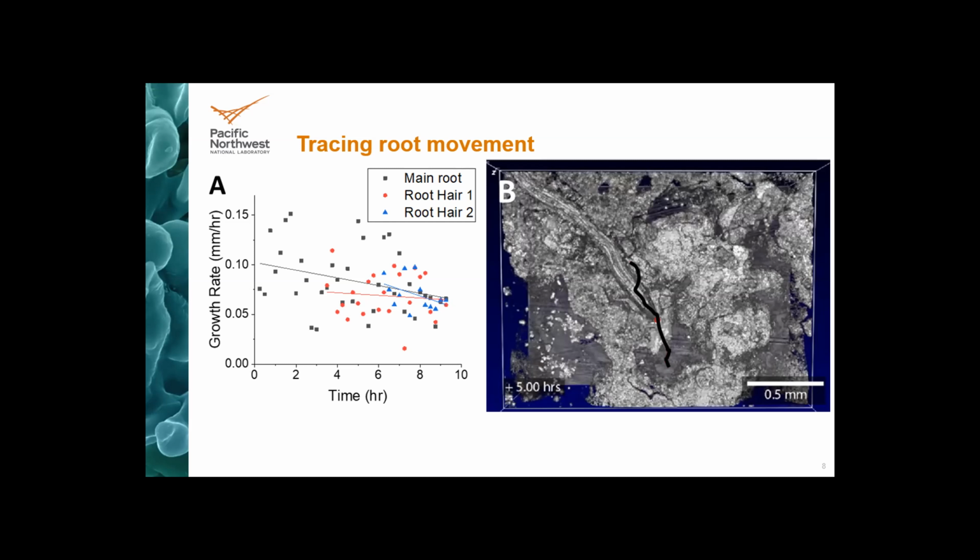Great. Thank you. And it doesn't have to be a 3D image like this. You could also set it up to do a line, and then you just get one profile. That can be advantageous because the full 3D image might take 30 seconds or so to take the field of view that you're seeing on this slide, but a single line can be done in many times a fraction of a second. It's imaging at, I think, 20 kilohertz or something. So you can image while you're moving the imaging end around, and you can still have pretty sharp images.